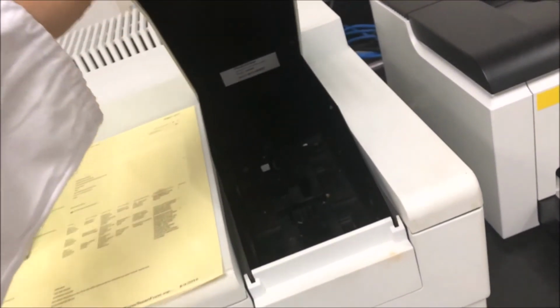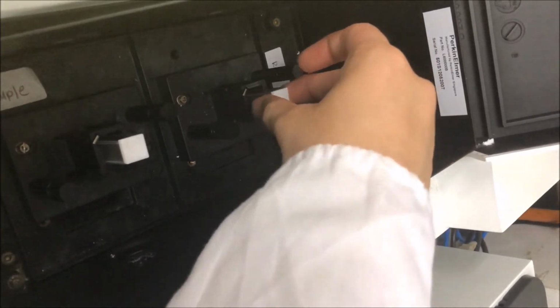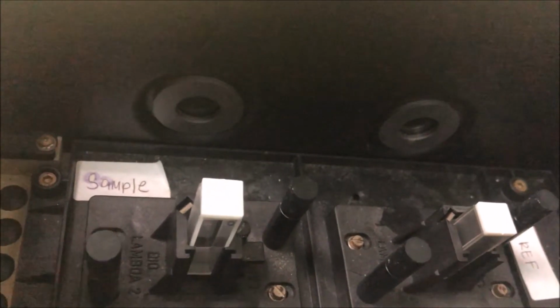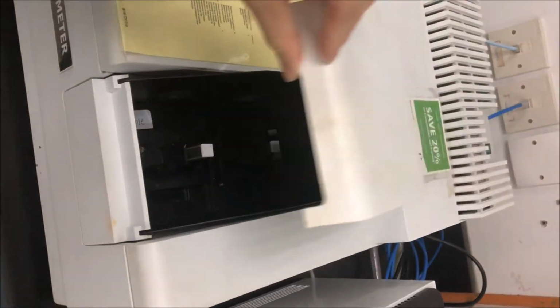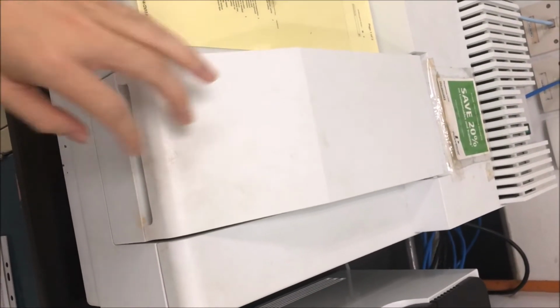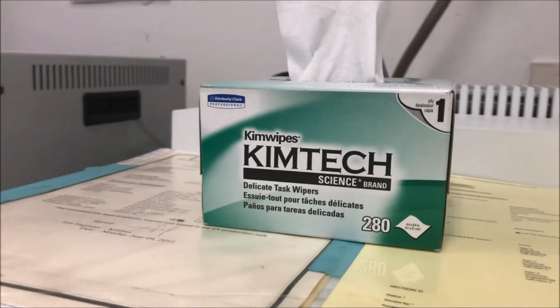These cells, filled with the substance, are then placed into the equipment in their respective slots. The UV in the machine is normally produced from hydrogen or deuterium lamps and will be passed through the cells through these glass panels. The UV transmitted is then measured with detectors on the other end. The cells have to be clean and fingerprint free, hence these special wipes are used to achieve that.